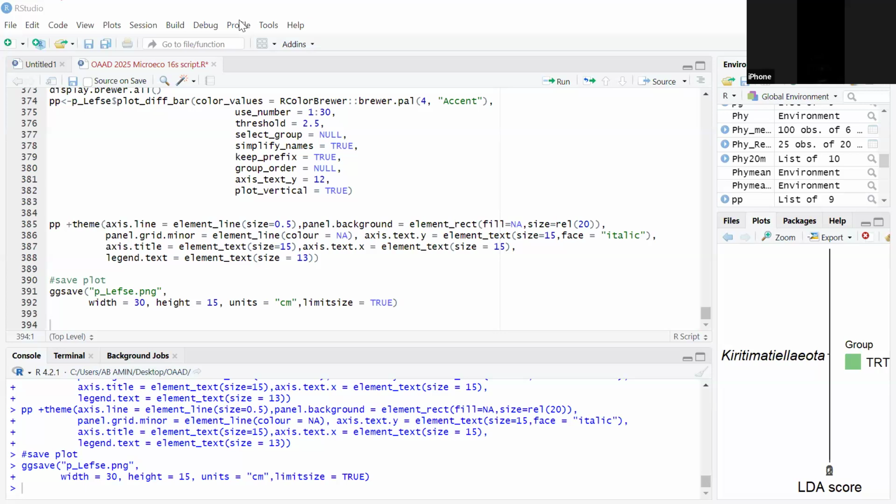I have already determined relative abundance of the bacteria, but now my boss is telling me to do the absolute abundance. And normally the one I have already done before is using qPCR, which I can determine gene copy number, maybe using the DNA. I have done this one. But later, when my metagenomic sequencing came back, he said, this is what we have done, we have done full length sequencing using spike-in.